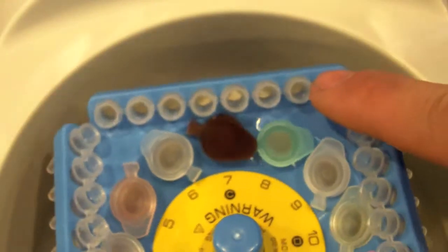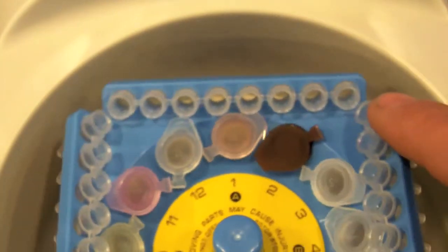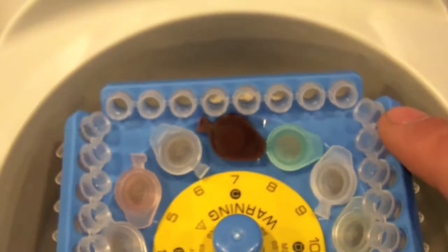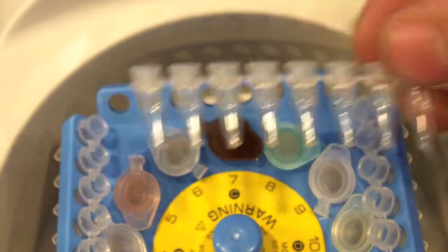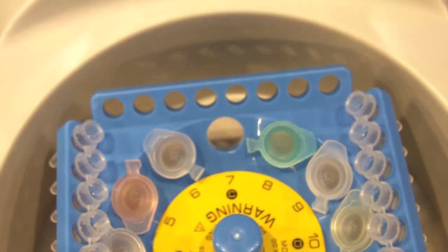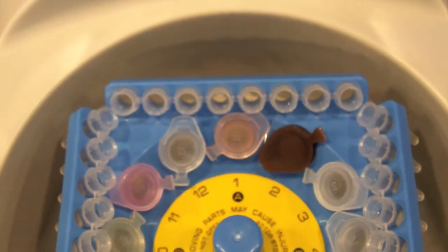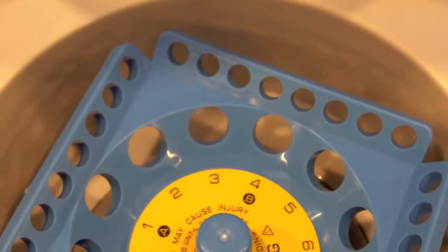instead of having a separate rotor for PCR tubes and microtubes, they put everything in one rotor. You get a rotor that can hold 32 0.2ml PCR tubes as well as 12 1.5 or 2ml centrifuge tubes all on the same rotor. So there is no need anymore to be switching rotors between the PCR tubes and the microtubes.